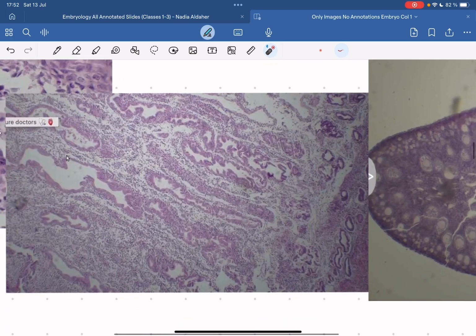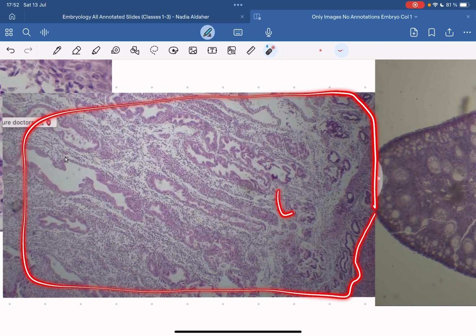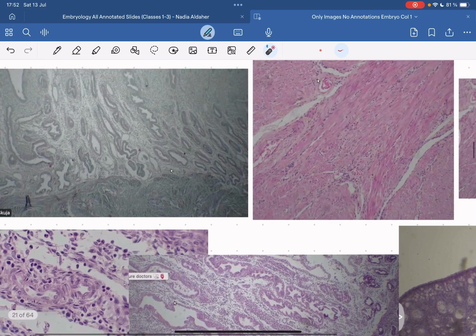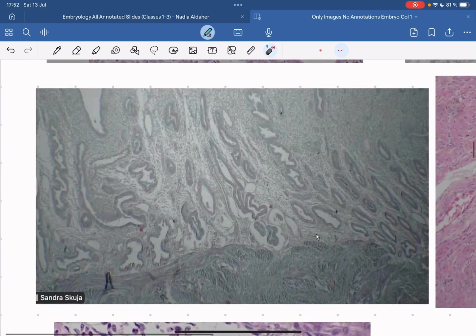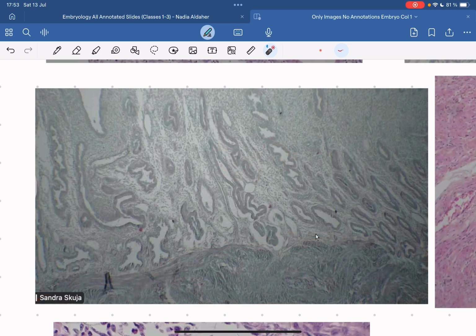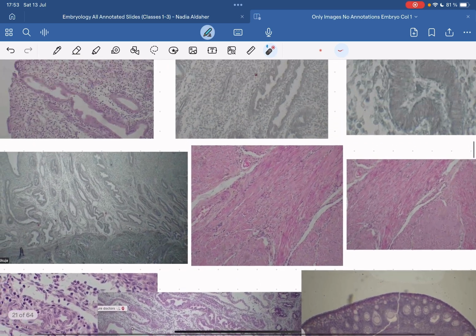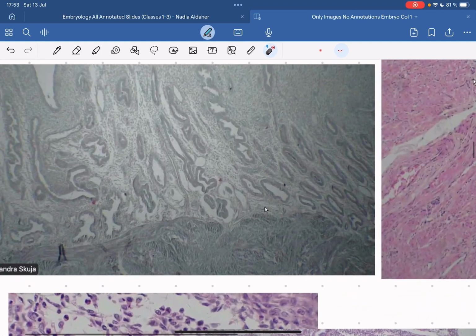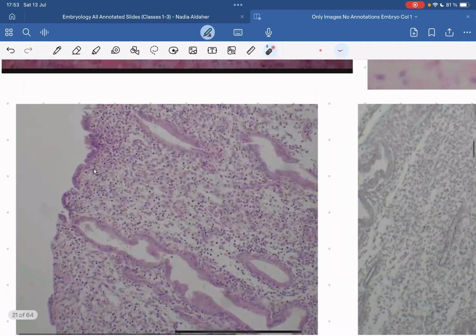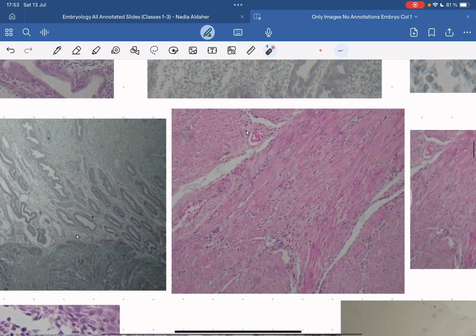So remember that. Here you might also see it, not as much, but this area would be the endometrium, and then this area would be the myometrium. Of course, they'll show you more of the myometrium, but just to give you a general hang of it, again, if you see this border, with muscle tissue here and gland, lighter area here, that is how you know that you're in the human uterus area, right? Okay, so that's just how much the microscope will zoom out, and that's how you'll know that you're in the human uterus. This is more myometrium.